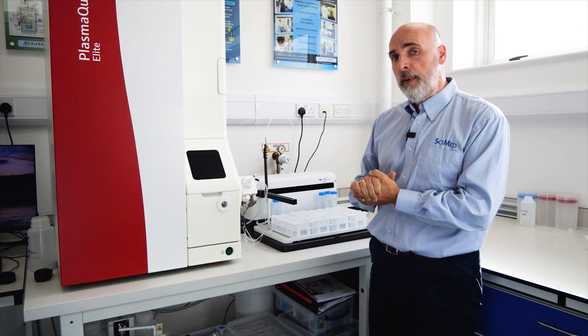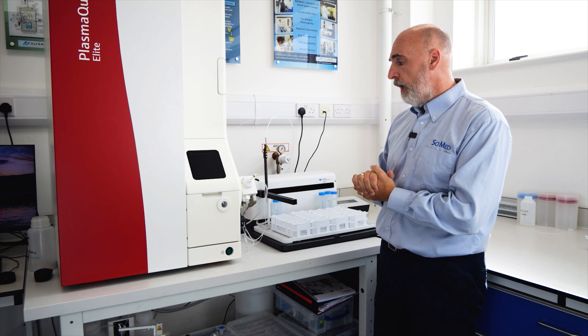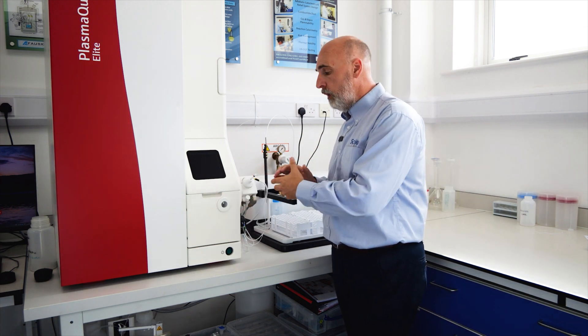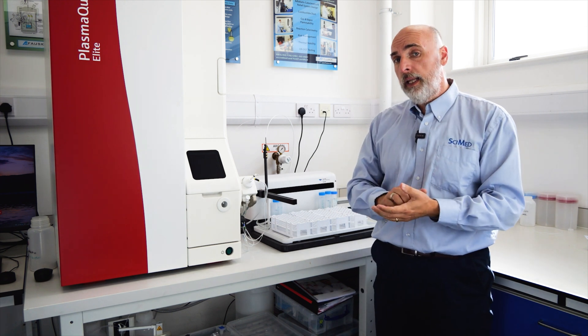I want to mention some of the key features and some of the benefits they will bring you in the laboratory. First thing I want to mention is we have dual sample introduction channels available. You could dedicate one for your clean low-level water analysis and the other for maybe your organics or your much more dirty heavy matrices work.